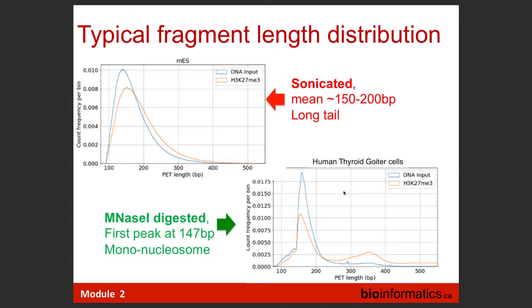but very quickly quality became better, so 50-60% for ChIP-seq was more or less an okay number. It all depends on your problem, right? Maybe Martin can comment a little bit more on this, but the amount of starting material, for example. What is your library? What went into your library? What kind of DNA? Your library can be naturally contaminated, so you're not expecting that everything will be aligned. But for ChIP-seq, the minimum mappability is 50%.